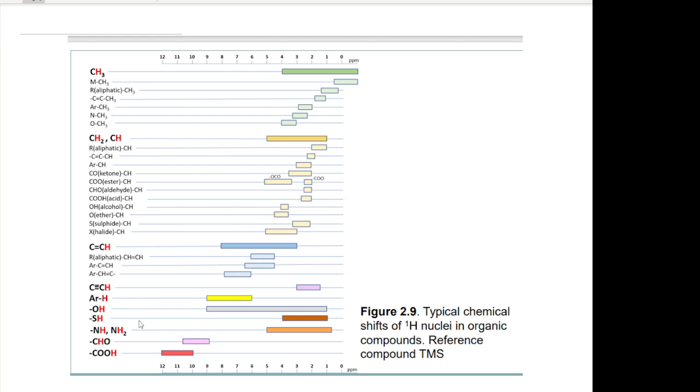So if your proton is attached to the carboxylic group, its value will lie between 10 to 12. If it is attached to, for example, the amino group NH2 or NH amide, its proton value will be around 0.5 to 5. These are just a range of different values. For example, the proton in CH3 can appear at 2 or 3 or 4. It depends on other factors.